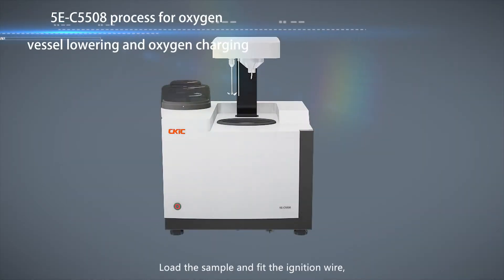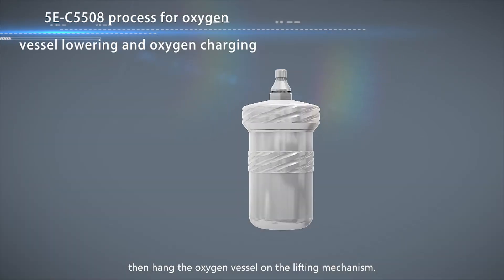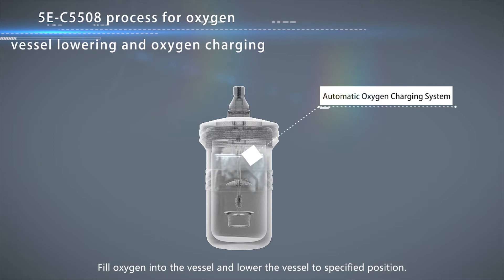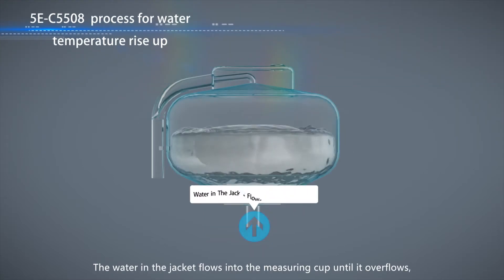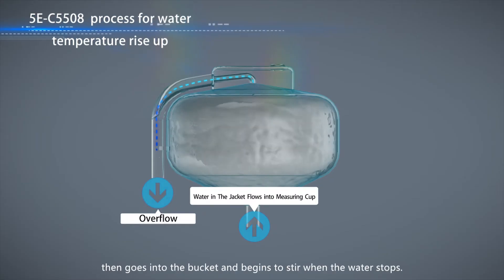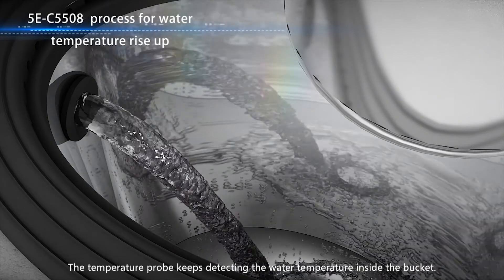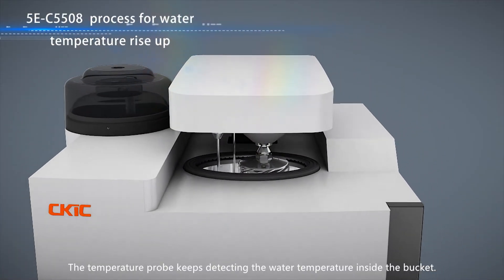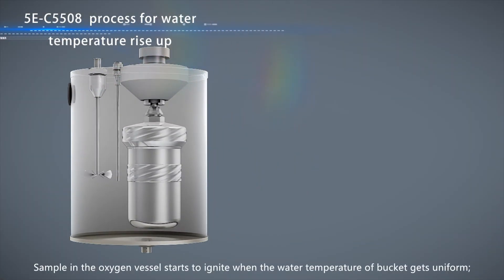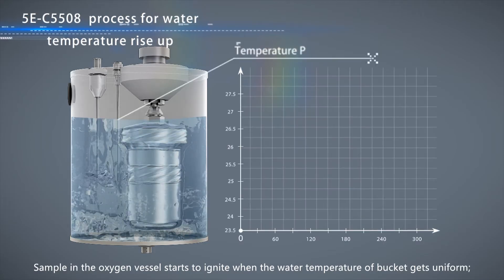Load the sample and fit the ignition wire, then hang the oxygen vessel on the lifting mechanism. Fill oxygen into the vessel and lower the vessel to the specified position. The water in the jacket flows into the measuring cup until it overflows, then goes into the bucket and begins to stir when the water stops. The temperature probe keeps detecting the water temperature inside the bucket. The sample in the oxygen vessel starts to ignite when the water temperature of the bucket gets uniform.